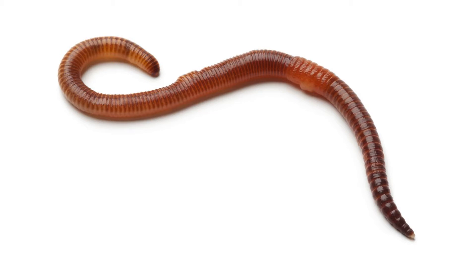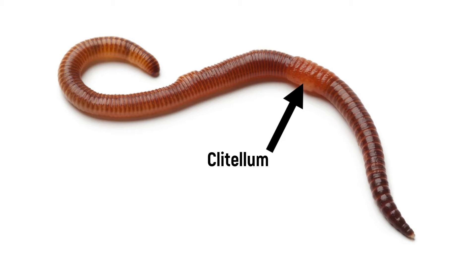The dorsal blood vessel can shine through in the middle of the back. From February to August, a lighter-coloured, thickened belt — the clitellum — can be seen in the front third of the body of sexually mature animals.